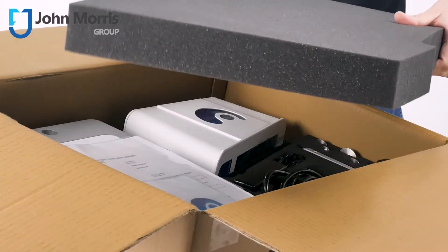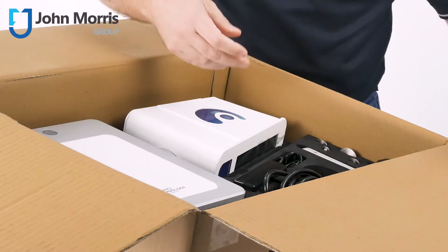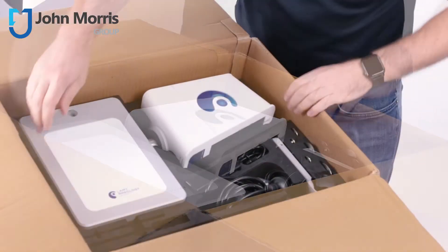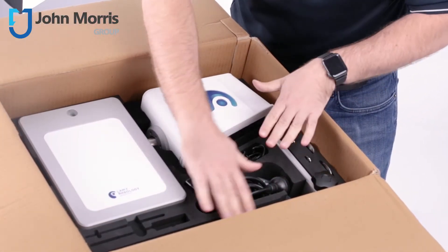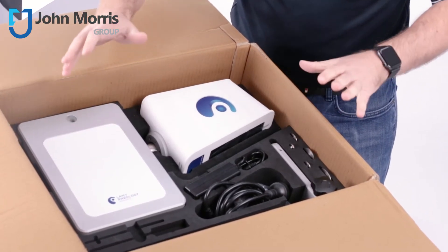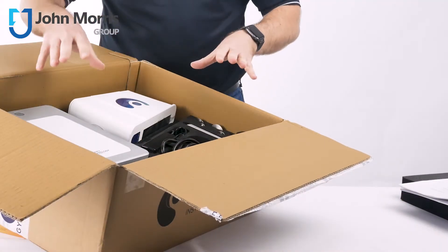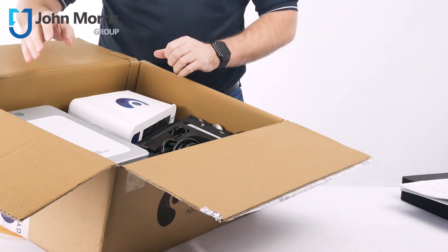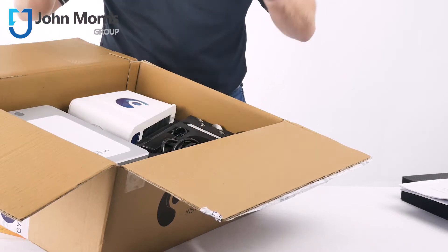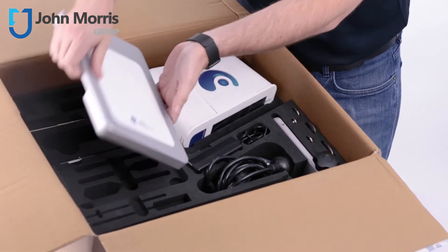You have this nice piece of springy foam here on the top, but then when you dive in and get a little closer, check out this molded piece of foam. And this has a dual use. If you ever want to send anything back to us, please keep this. But also, if you choose to buy their carry case, this piece of molded foam comes out and directly goes into the carry case, and it'll hold everything, including all of the accessories.